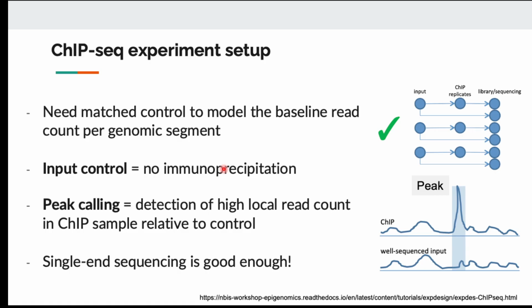There is no antibody, no pull-down, that can perfectly enrich only certain proteins with no free DNA coming out. You're going to have some free DNA that has no transcription factor, no histone modification, in your sample. So what the analysis techniques want you to do is understand, if we don't perform any immunoprecipitation, what kind of sequencing data are we getting?